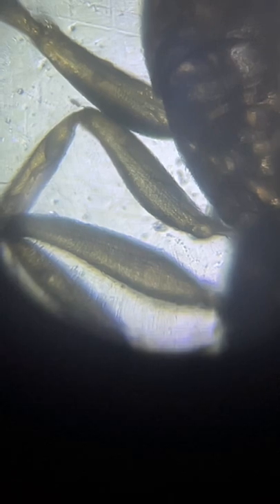It's amazing how much detail you can see in these tiny little ant legs. We hope you liked viewing the sample as much as we did, and make sure to follow and like for more Foldscope at home.